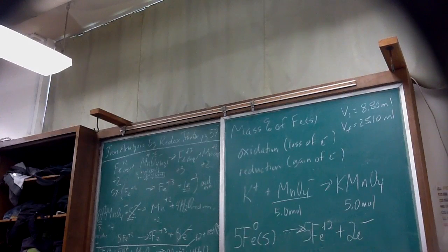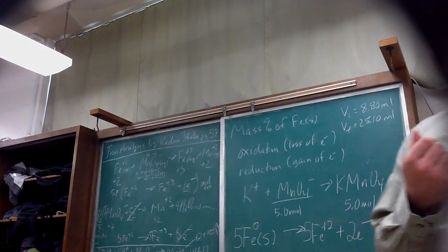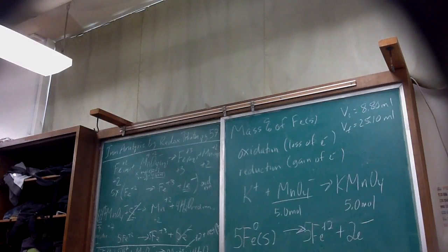Now, in the manual, it tells you it's supposed to be a different percentage or a certain amount. But the problem is the one that the manual says to use is very, very concentrated, so it's very thick. It's kind of like syrup. So if you try to dispense that material, it wouldn't even come out. So what he did was make up a different solution of this stuff. He typed this out, about 7.4 milliliters. He's already set this for that amount. So the same one that was in here, just take the knob here. You're going to pull all the way up until it stops.